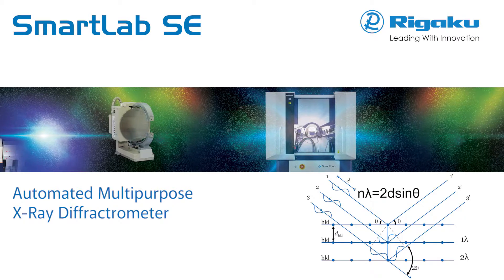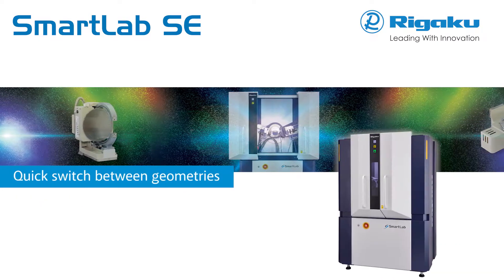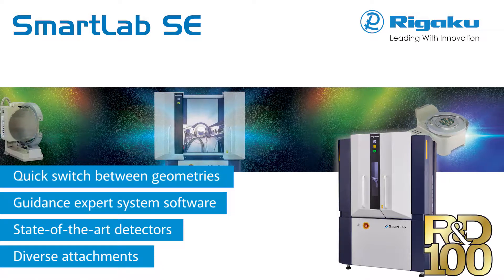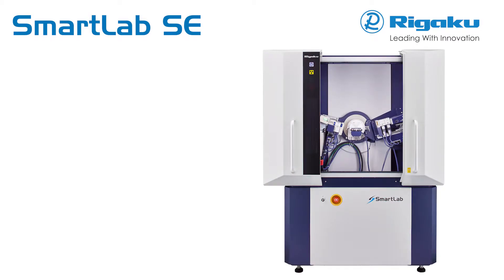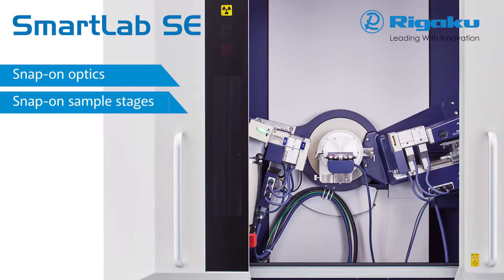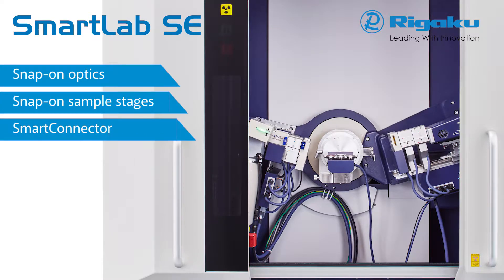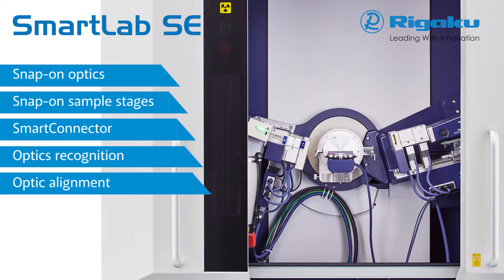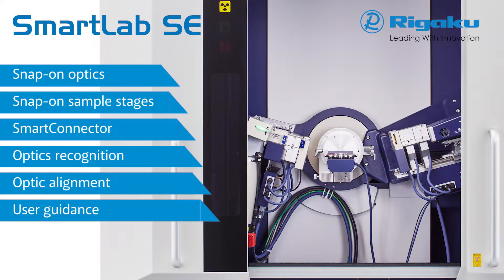SmartLab SE offers continued refinement of the original ease-of-use SmartLab features that resulted in the prestigious R&D 100 award. SmartLab SE is a highly versatile X-ray diffractometer featuring innovative snap-on optics and sample stages, smart connector, optics recognition, automatic optical alignment, and user guidance expert system software.